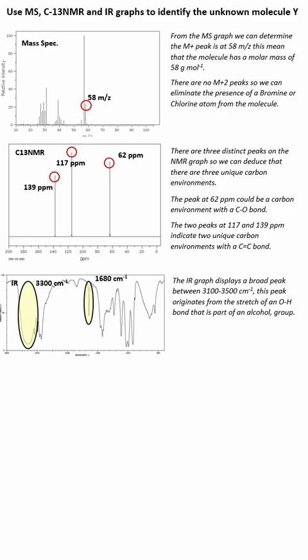We can see this other little peak here. Often a little peak in this zone, around about 1600, indicates that there is a carbon-to-carbon double bond. It's from a carbon double bond carbon stretch. And so here we're going to write down that we think this could be evidence that supports that there's a carbon double bond carbon.